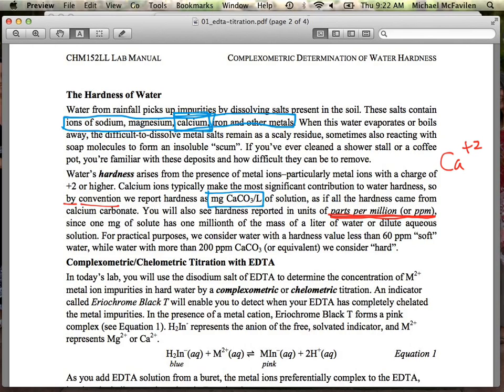Anything remotely negative. Okay? So what we're going to try and do is pick some kind of extra species that can react with the calcium ion that's present. Okay? And we need it to react in 2 ways. Okay? One way, first off, what's the color on calcium? White or colorless, we aren't going to see it in our solution. Okay? So one thing we need to for sure do is somehow get something observable in there so we can see it. So our calcium ion needs to react with an indicator.